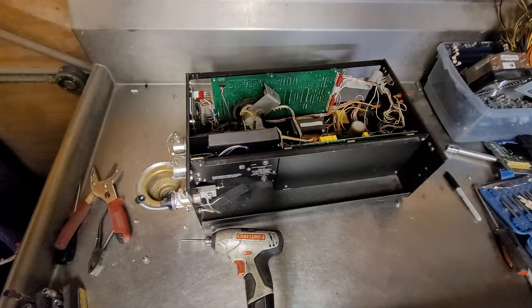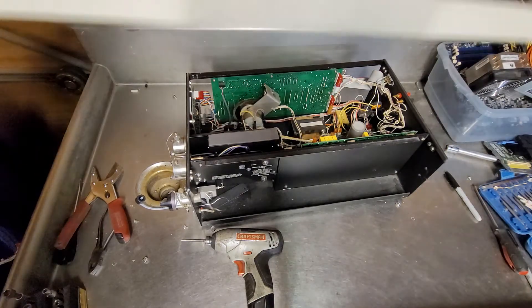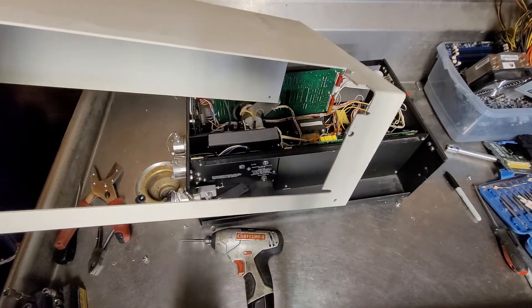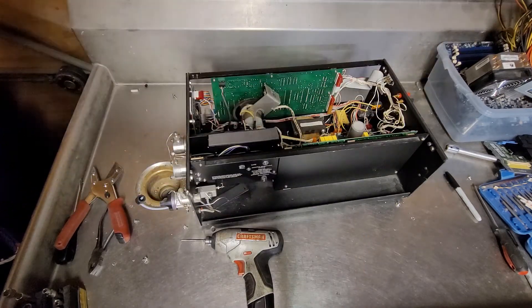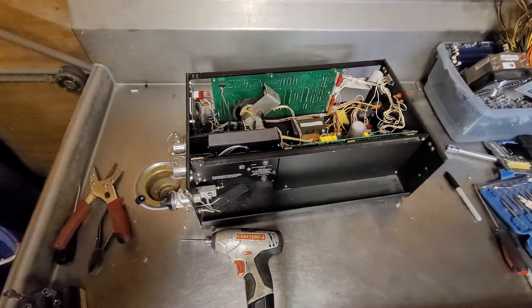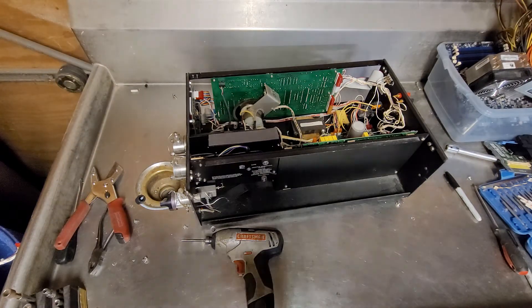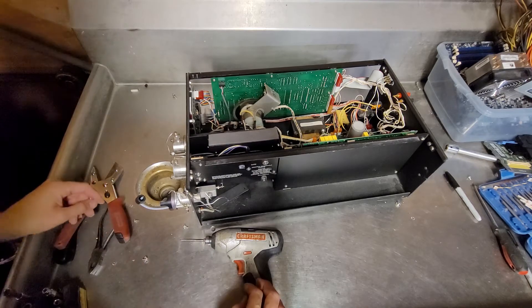Just a folded sheet of aluminum, like the other one. I'll have to do a little bit of cleanup on this one because there's some screws there. That's just a scrap metal thing though — they pay you better if the aluminum's clean. No brass or steel or stainless or other metals.